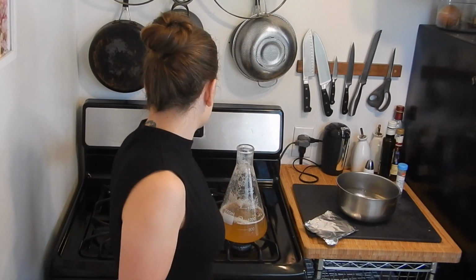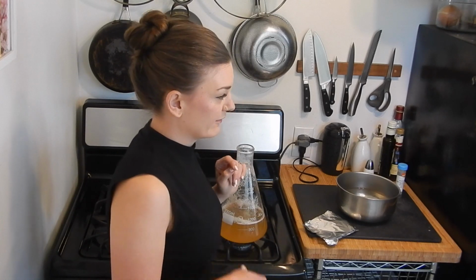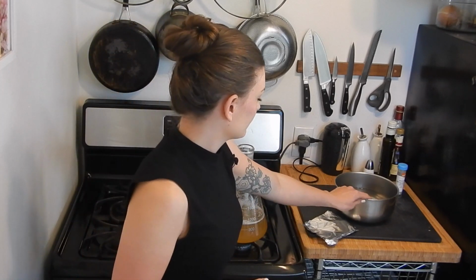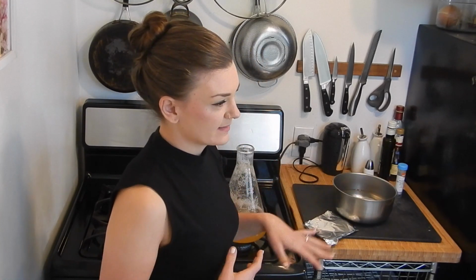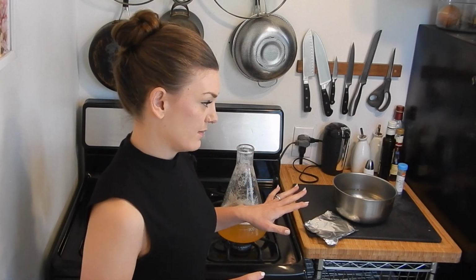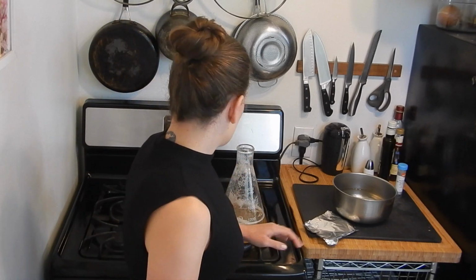Sometimes I stick it in my freezer. But I actually feel like it touching the water cools it down a lot quicker. So I'm just going to put it in this bowl and then add some ice once it's kind of stabilized. Don't put any glass into ice water if it's been boiling, because that's how you break glass.